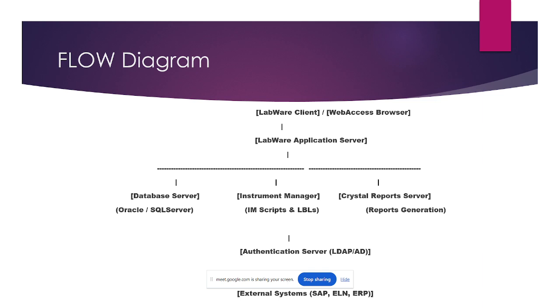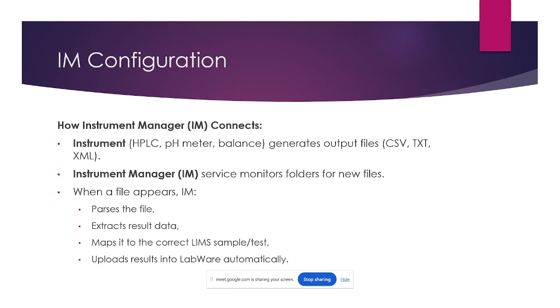That is the LabWare application server. Coming to the IAM, I already explained. If any instruments are there, we use a CSV file, TXT file, or XML files to integrate with the instrument manager. The application we will integrate to the application. For this we are using some parser files. For this integration purpose, we are using some parsing scripts, especially with the lab application servers.